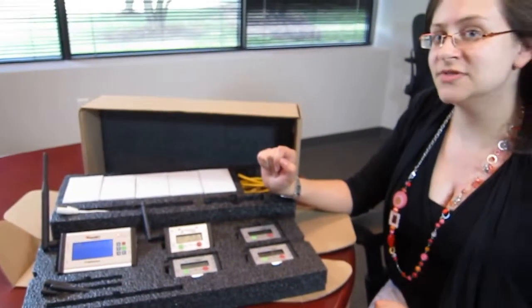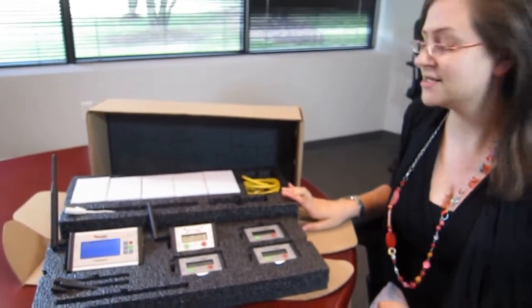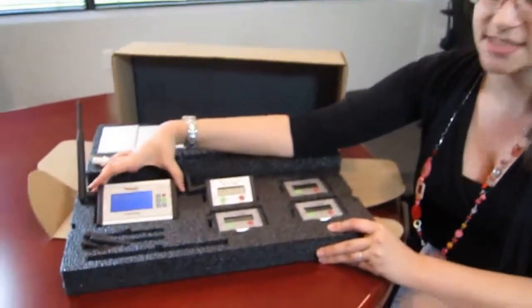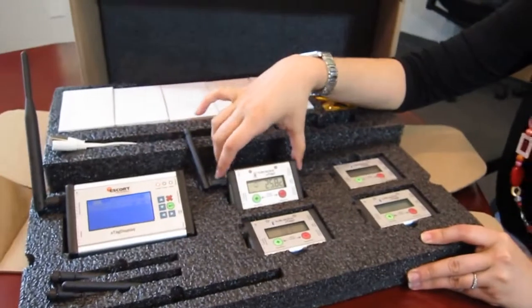I am pleased to introduce you to our new Star Kit from Your Door Express, which is a real-time monitoring system.